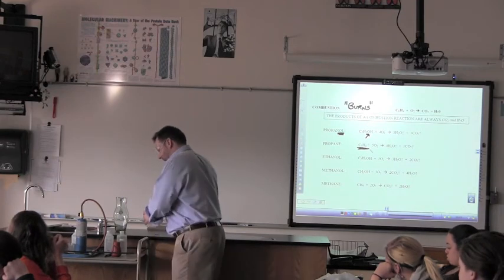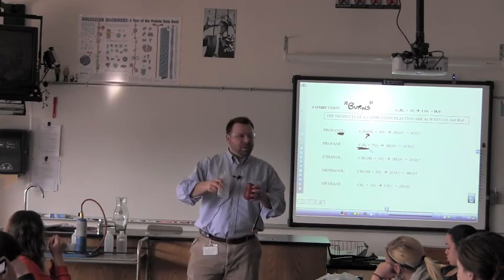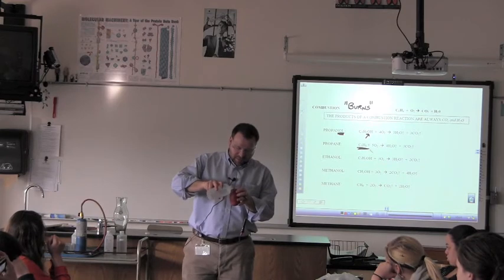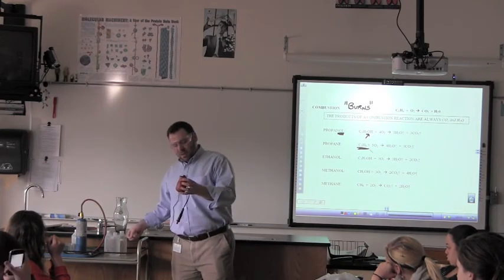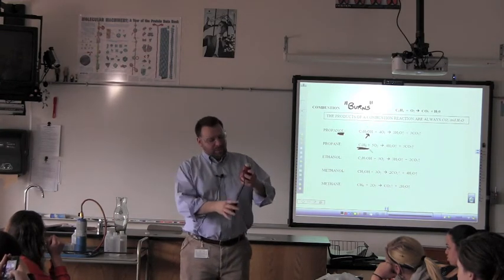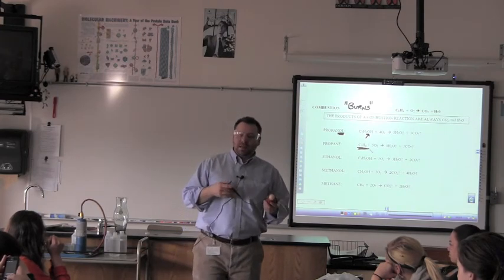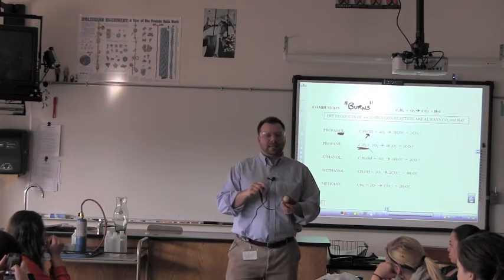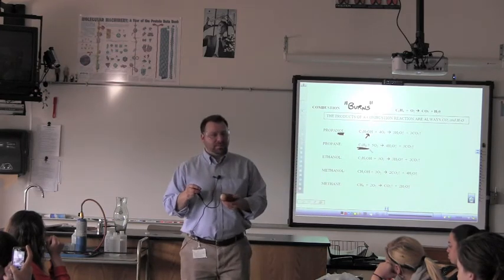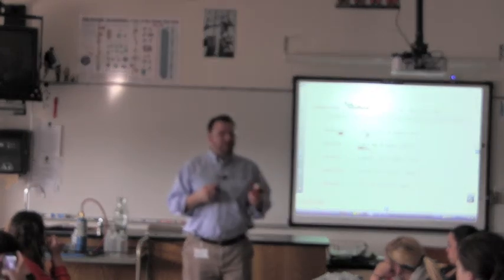Okay, so what we can do is take a look at the power of this. And again, if you have an internal combustion engine, you're going to control where combustion is taking place. So we'll just add a little bit of the ethanol here. Don't need much. I'm going to consider this as my internal combustion engine. In internal combustion, you start the combustion reaction, and in the combustion chamber, it's going to produce gases that expand rapidly. In an engine, those gases push pistons forward, etc. In this case, it's just going to move a ping pong ball.